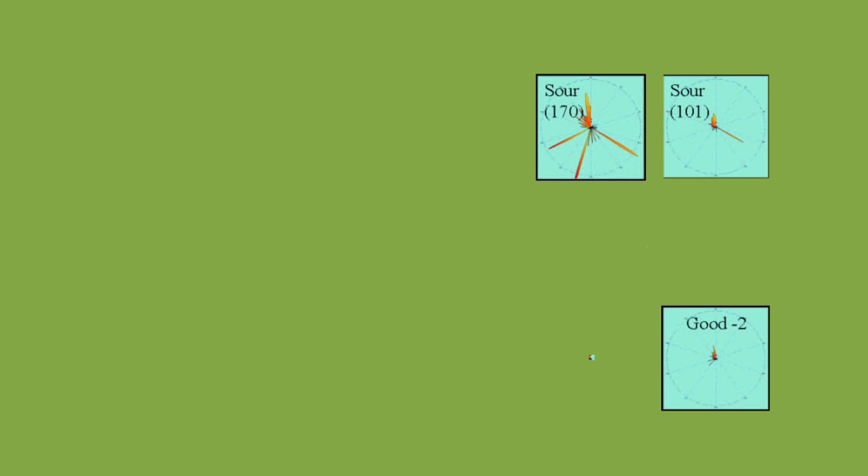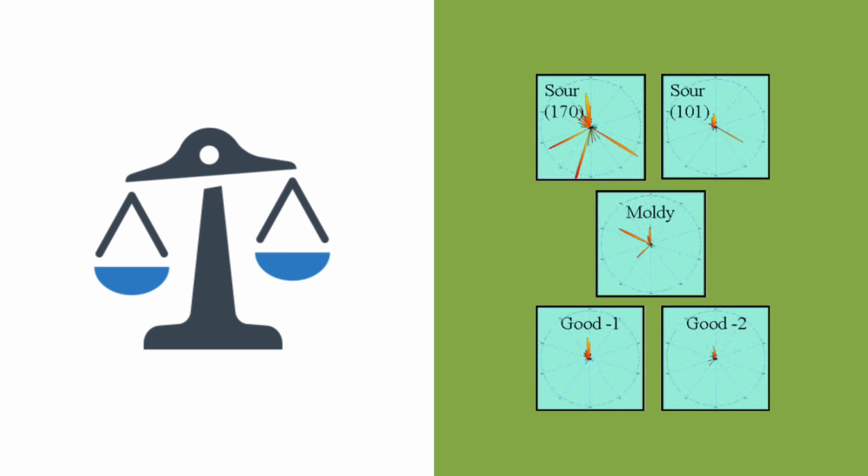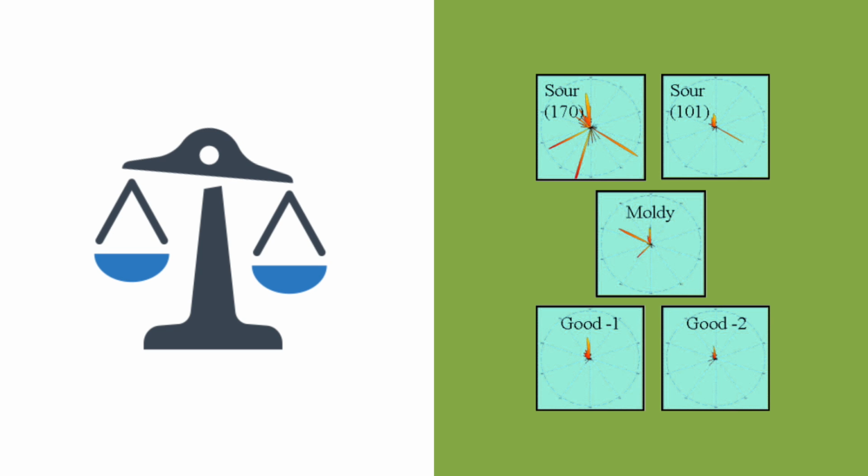The olfactory images of all 5 corn samples also indicates a comprehensible comparison. The relatively odor-free chromatograms of both good corn samples give only small images, as their odor concentration is low. Whereas, the lactic acid peak of sour samples and the distinctive compound peaks of moldy corn are easily recognizable, indicating high concentrations.